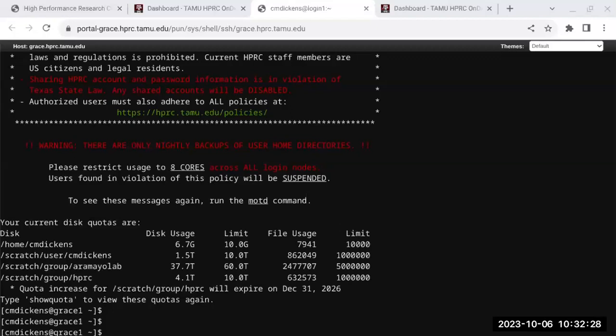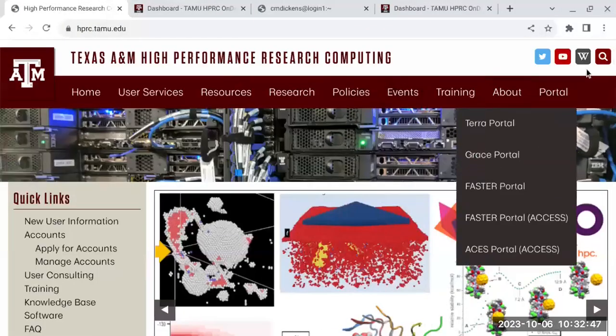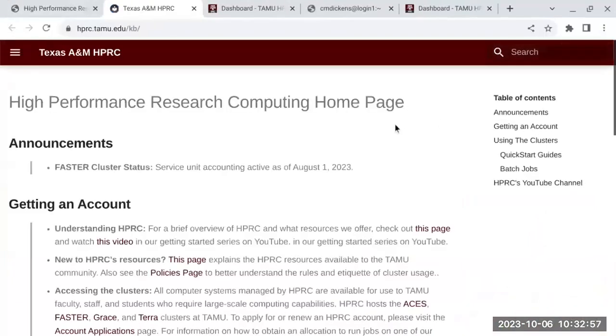All right, let's talk about some tools, how to use these, where to find them. You can go to our website. From our website, up in the top right, there's this W. That's actually the Wikipedia icon, but it's not Wikipedia. It's MkDocs.